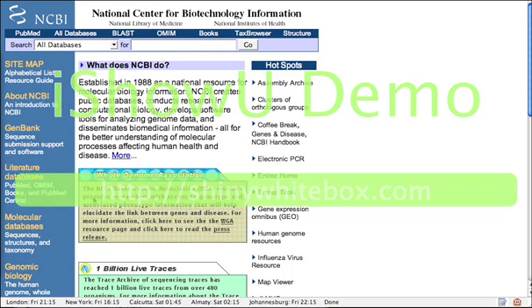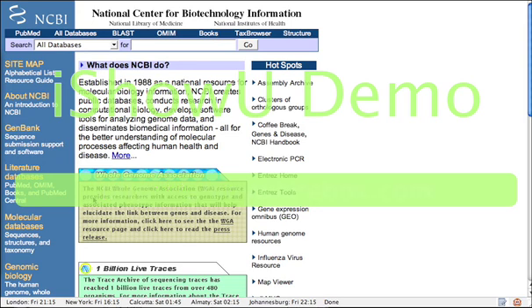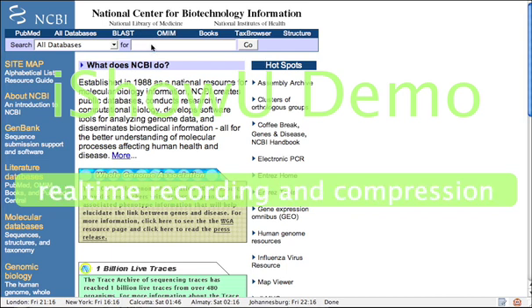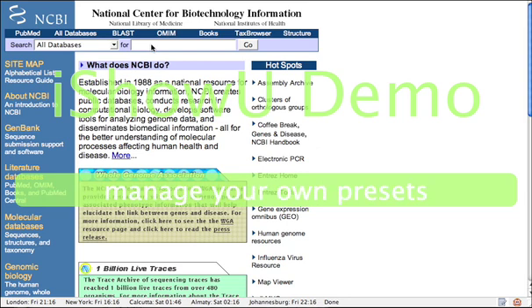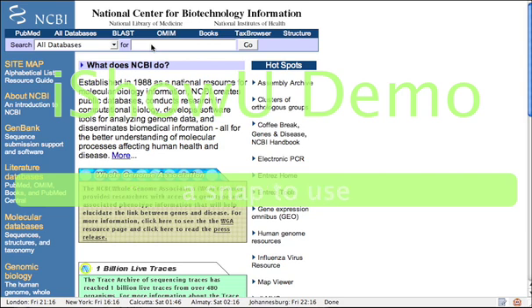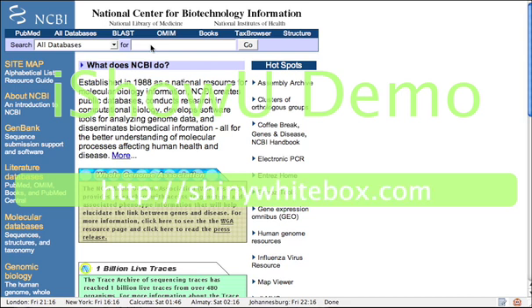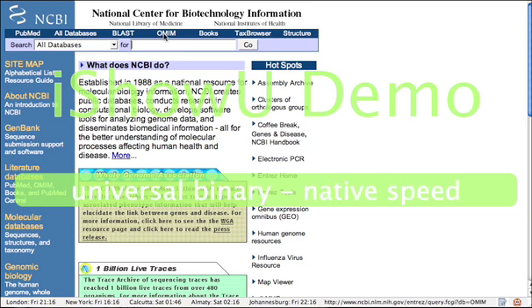Hi, today we are going to look at some functionality offered by the NCBI database for cloning ORFs from bacterial genomes. The ORF we are interested in cloning comes from a particular bacterium, Cupriavidus metallidurans. So we will look for this particular bug's genome in the All Databases section of the NCBI site.